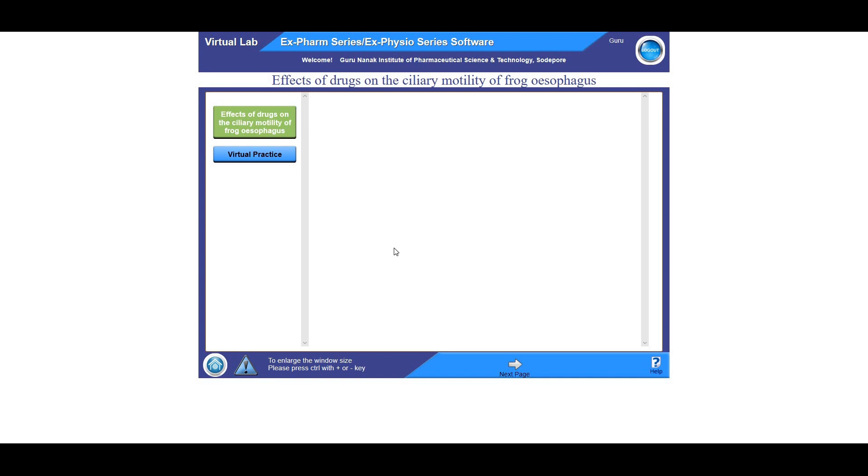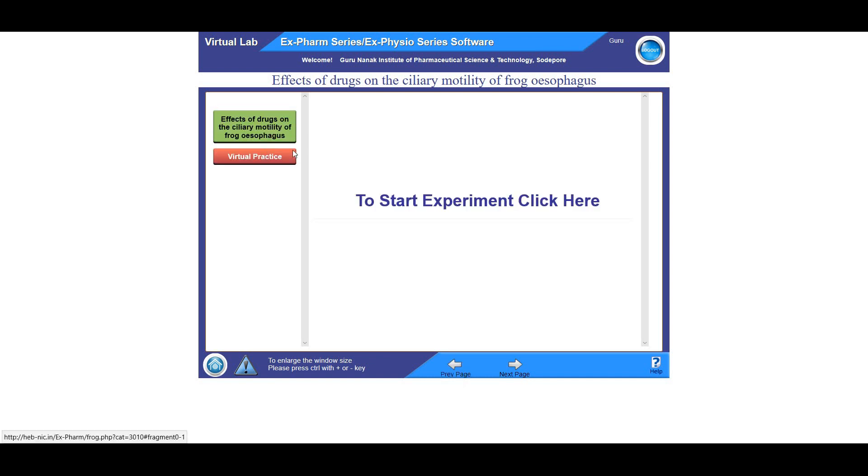So I'm going to see how the effects of drugs are acting on the ciliary movements of frog esophagus. So first I need to click on virtual practice. Then I will click here to start the experiment.